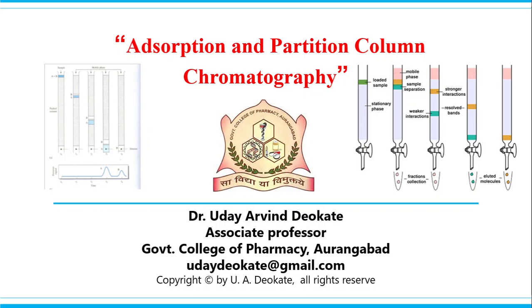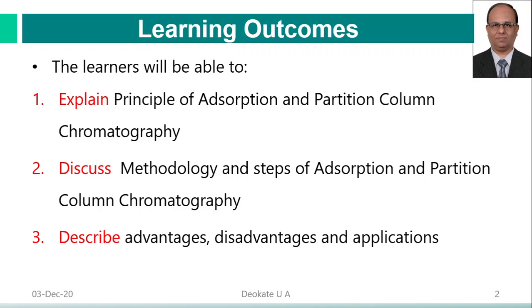Hello student, welcome to this video on adsorption and partition column chromatography. In this video, we will learn about the principle of adsorption and partition column chromatography. We'll learn about the methodology and steps of adsorption and partition column chromatography, and the advantages, disadvantages, and applications of column chromatography.